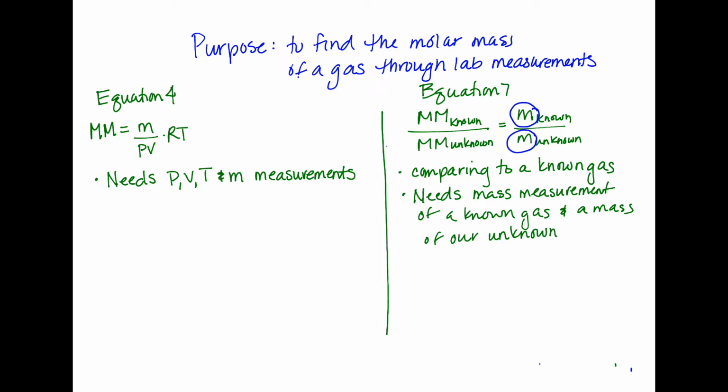So that's only two measurements that we need to make. But it also means that you need a known gas, something that's well studied.